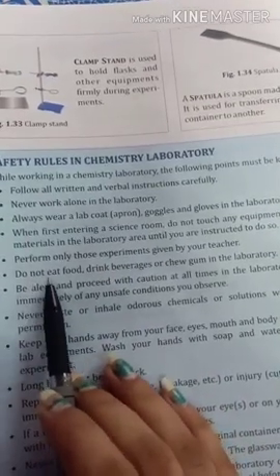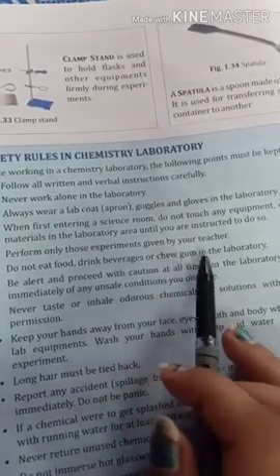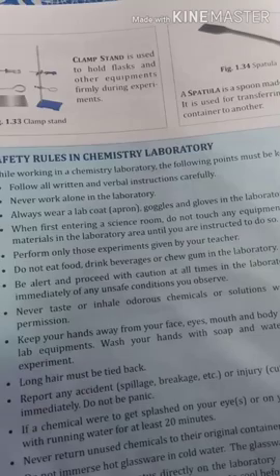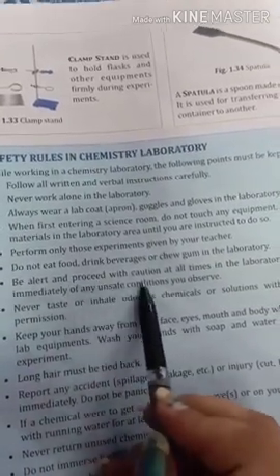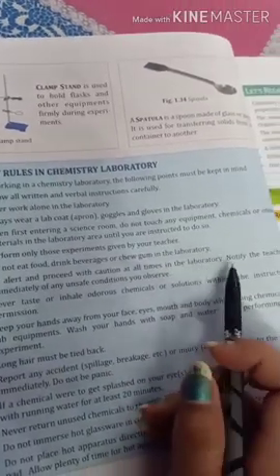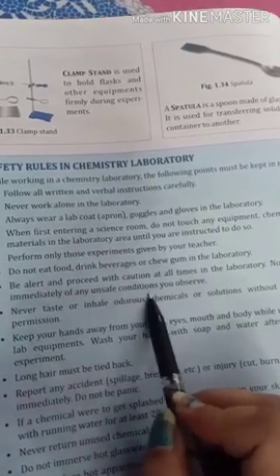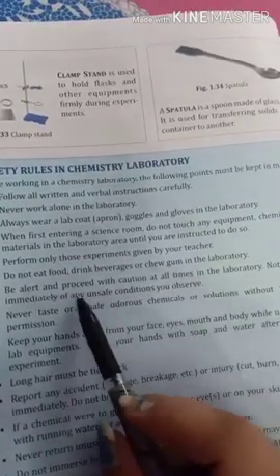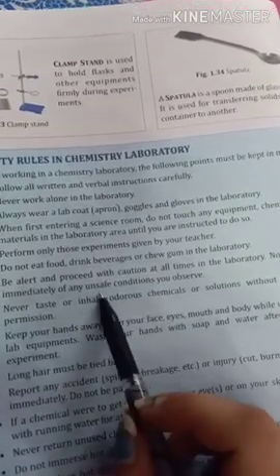Next, do not eat food, drink beverages or chew gum in the laboratory. Be alert and proceed with caution at all times in the laboratory. Notify the teacher immediately of any unsafe condition you observe. So if you observe any unsafe condition, immediately inform your teacher.